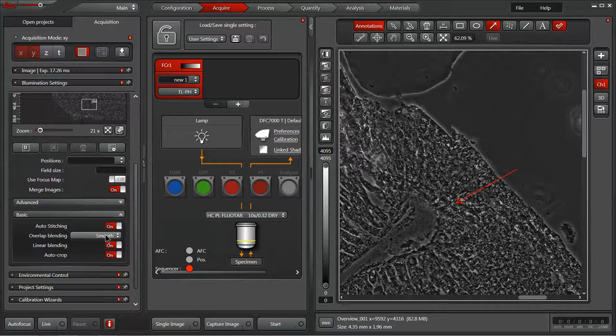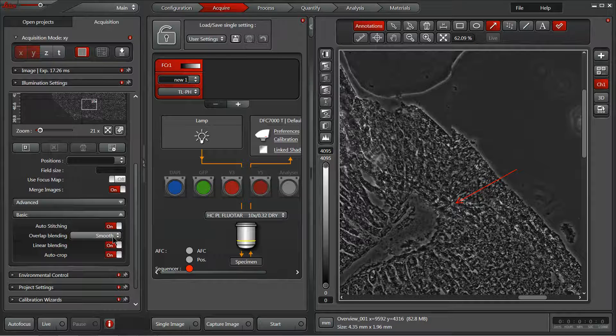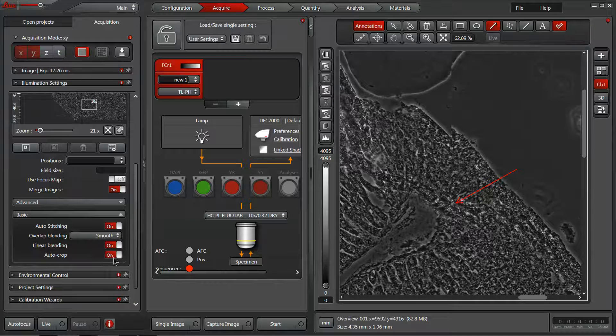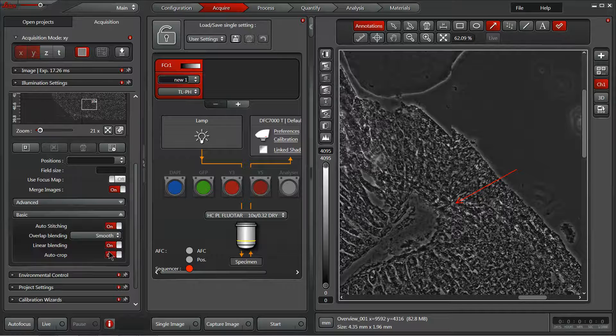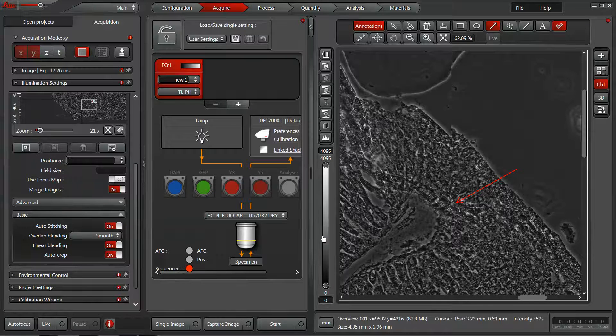You can control between a smooth and a statistical overlap blending. Smooth works well for most things I've done. Also this auto crop feature I like to use. The auto crop feature will take care of any black spaces around the edges of our final image just with a simple crop feature. It's quite nice.